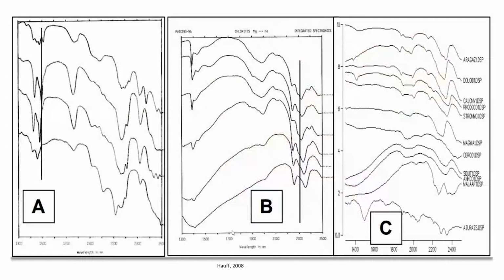So for the spectral plots you see here, spectral plot A is for alunites of different compositions that range from top to bottom. If you're looking at the region right here, you'll see this line. This showcases that compositional change from top to bottom, from calcium to sodium to potassium to NH4. You'll note that the diagnostic feature ranges from 1495 nanometers for calcium to 1460 nanometers for NH4.